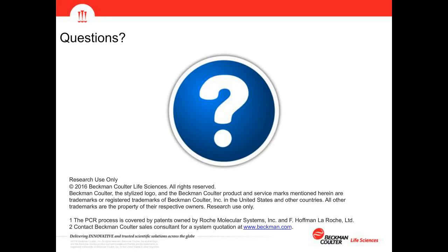Can you automate transfection? Yes, we have a lot of examples where we have successfully automated transfection, and there are different ways of transfection. So we have automated transfection using chemicals, so transfection reagents. We have used biological transfection with viruses, and we have also used electroporation by integrating electroporators. So all different ways. The efficiency is usually very, very good. It does benefit from the reproducibility you get with the liquid handling automated across a plate.